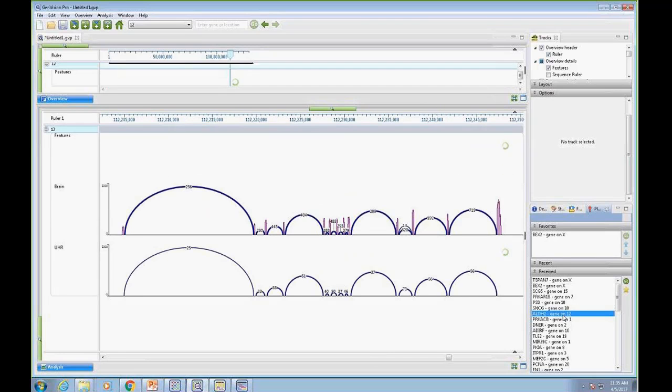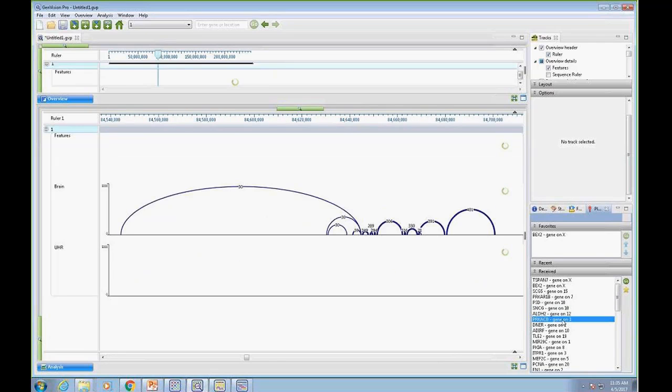All these genes that met my criteria, do any of them show splice pattern differences between the 2 different tissue types? And so I see here's another one where it looks like there's some kind of splicing event occurring in this region. And so I can load this in.